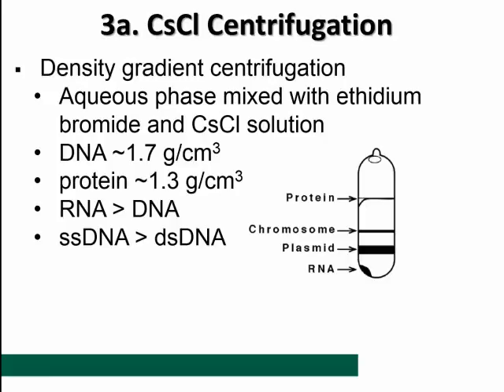Since you have a DNA solution mixed in there, the DNA within that solution is going to find the gradient at which its buoyant density is identical to the density of that layer, and it's going to settle in at that layer. Normally, in the old days, you would add ethidium bromide solution to that at a final concentration of 0.5 microgram per mil, so that after you centrifuge it in a sealed tube, you're going to have different bands. Here's a picture of what the bands look like.